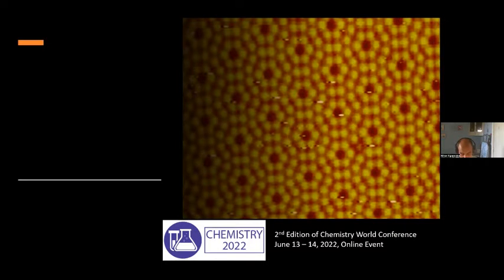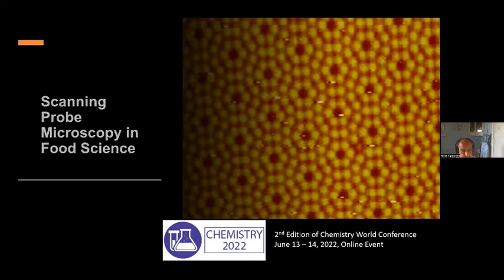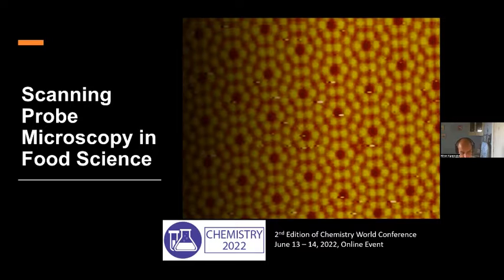In contrast to previous talks, my talk will be a short review on scanning probe microscopy in food science and is not an active research currently in my department. My background is experimental condensed matter physics, working with scanning probe microscopy since 1996, applied to nanostructures combined with light sources like laser or synchrotron radiation.